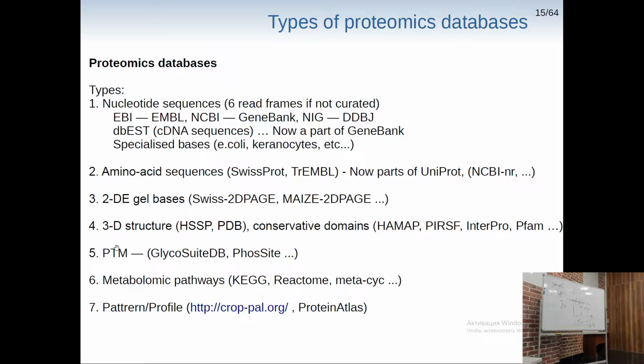What can you do? You can load this list of differentially expressed proteins into software, which checks either gene ontology of your proteins or those databases to see that, for instance, the difference that you see is mostly the MAPK signaling cascade, for instance, or something that has some relation to the cell cycle or whatever. So it's possible to analyze not protein by protein, but just to see what biological functions are affected by this change of proteins. And you will have to use those databases.